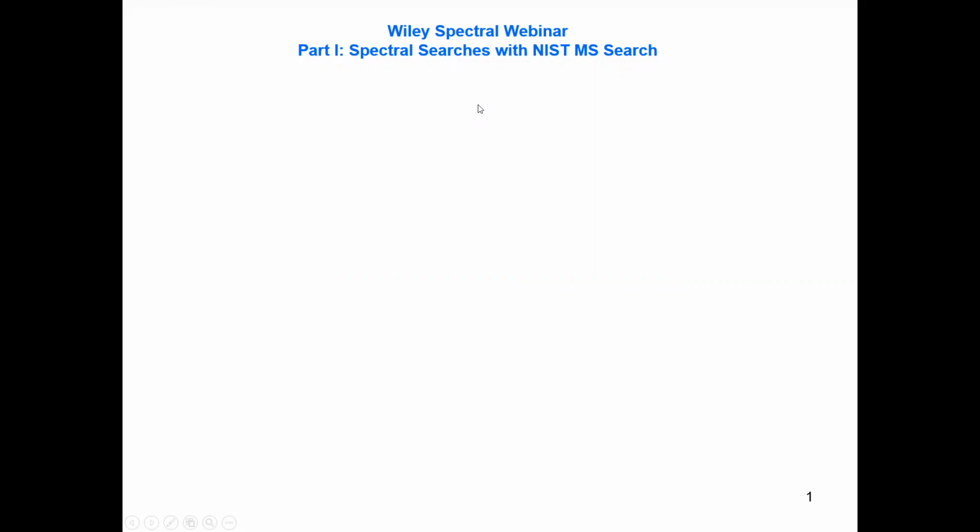I'm recording this video about a Wiley spectral webinar. I also did it for Wiley on their channel, but I wanted to also record one for my YouTube channel. So I want to share part one of it, the spectral searches with the NIST MS Search.